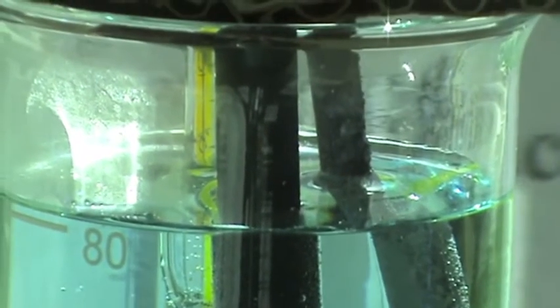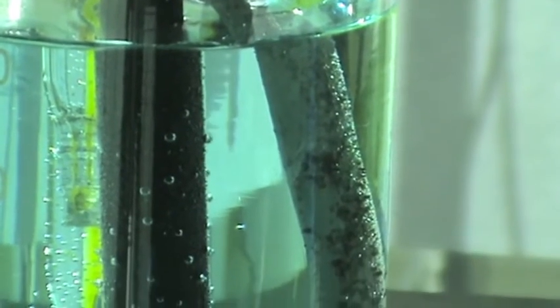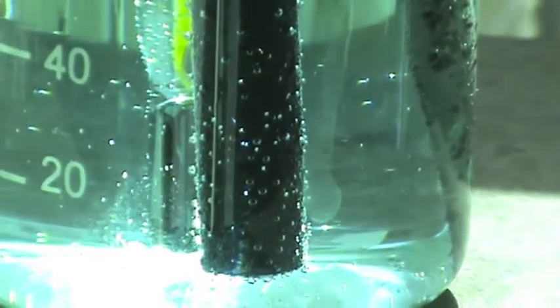It has been found that rotation or oscillation of the anode, effect of additives to the bath, for example cetyl trimethyl ammonium bromide, and the influence of ultrasonics, will give an adherent smooth and pinhole-free deposit of lead dioxide.